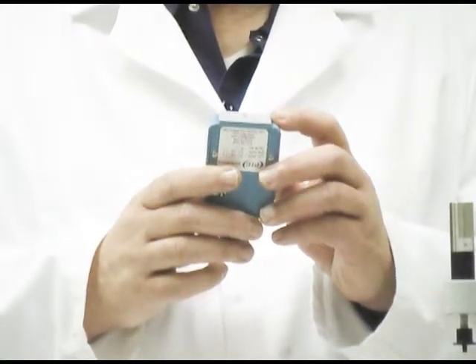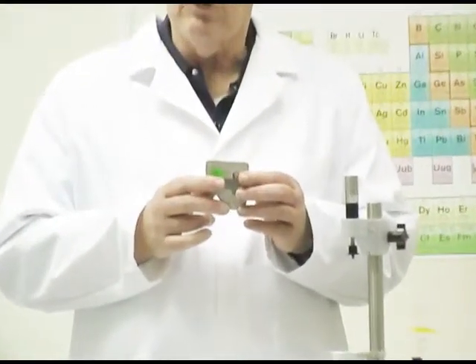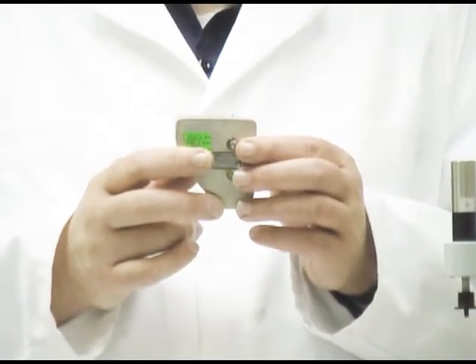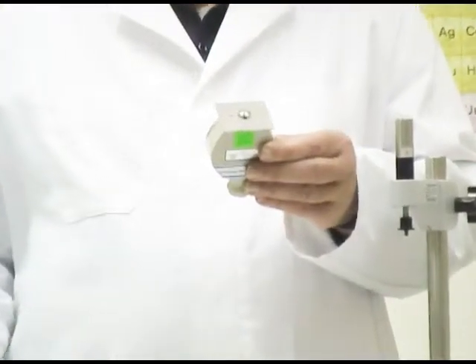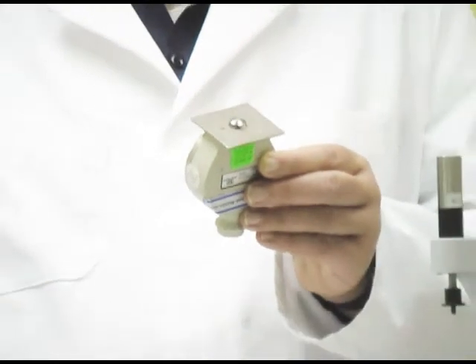The Shore D tip is very sharp and pointed so that it can penetrate the surface of hard plastic material. The Shore A durometer also has a scale of 0 to 100, and its tip is also sharp but not as sharp as the D durometer — it's slightly flattened because the rubbers or plastics it penetrates aren't as hard. The Shore 000 durometer has a half semi-circle shaped tip designed to provide force over the surface of very soft, almost gel-like plastic materials that have very little hardness.